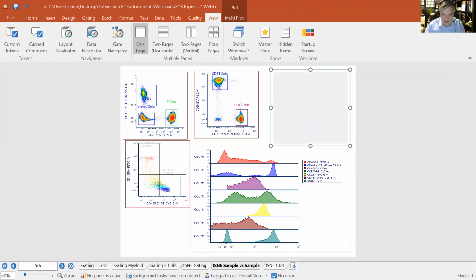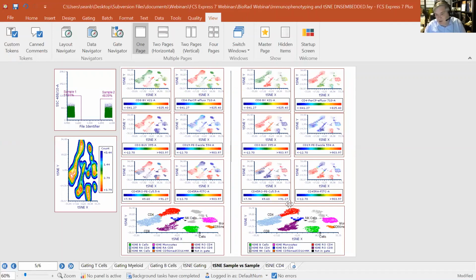There are cases that you can do that. But one of the really nice things about this is, if I have many different data files and I've merged them together and I've identified where the populations are, very easily at a glance I can compare, say, file 1 on the left to file 2 on the right, and maybe there's a lot more NK cells in file 2, or there's a lot more NK cells in treated versus untreated, right?